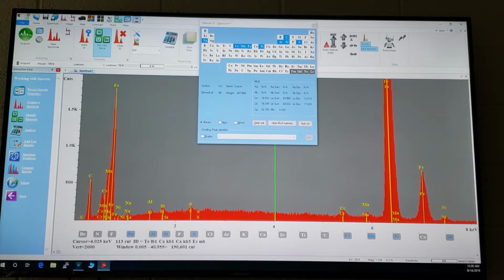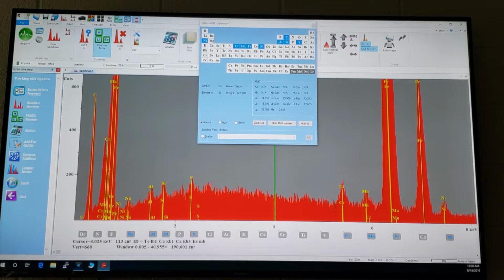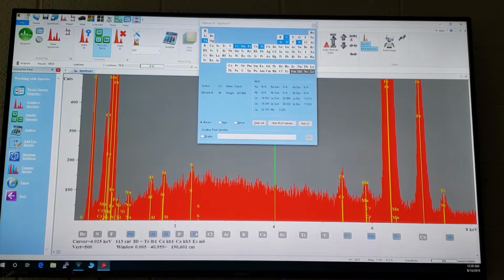So the buttons align with the peak, the K alpha line. Automatically? Well, if the peak is lit up where sulfur sits on a kV scale, sure. This sulfur line, the button lines up with wherever that line is. So if that line is at 2.305 kV, that's where sulfur gets lit. Well, guess what? I got sulfur.